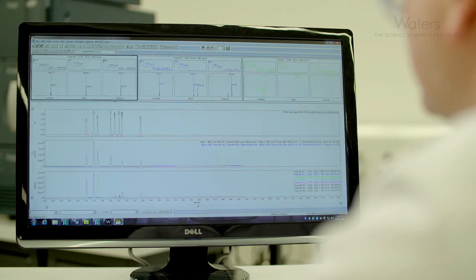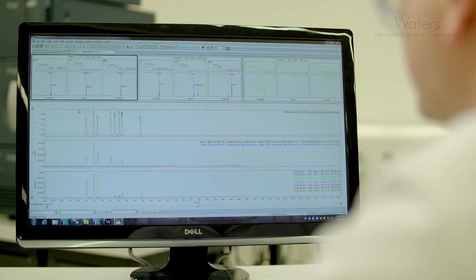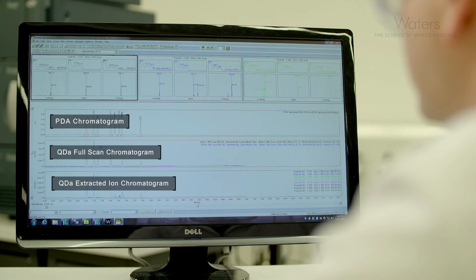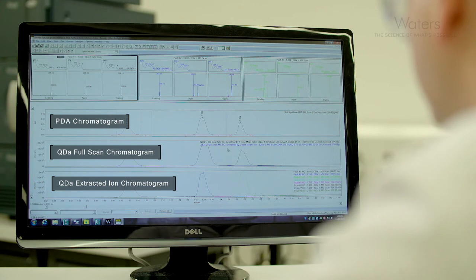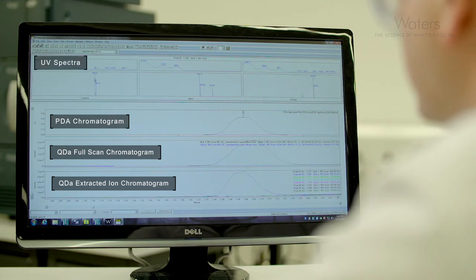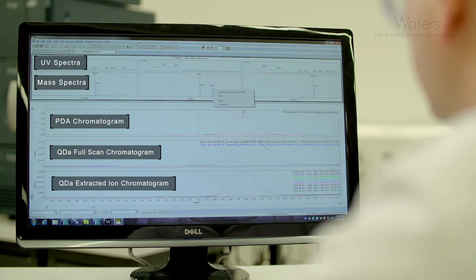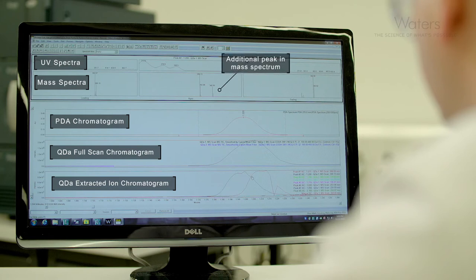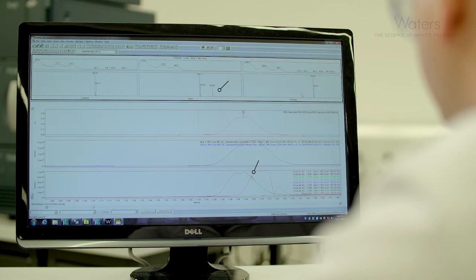with a combination of the Acuity QDA and the Empower software, we can review the data in the mass analysis purity window. And it's here that we combine the UV data with the mass data, and we actually annotate the UV trace with the mass of the analyte. If we look at the mass data, we can now see that there appears to be more than one compound under this peak.